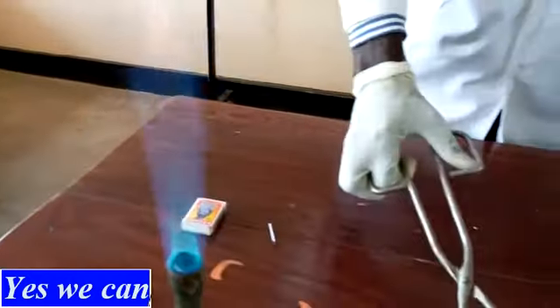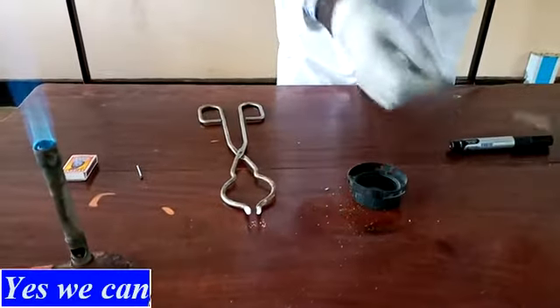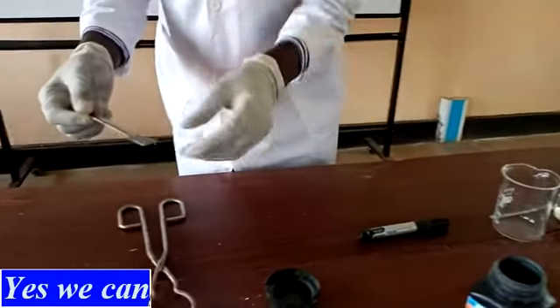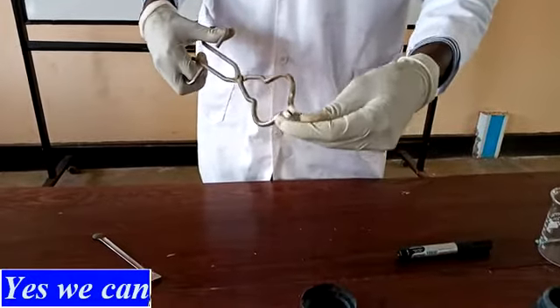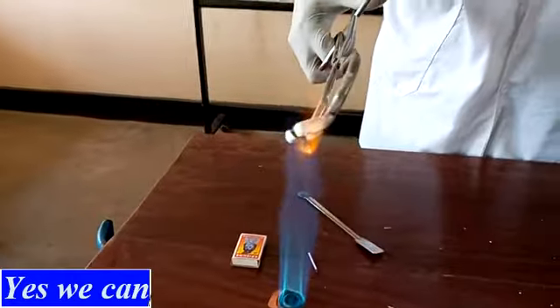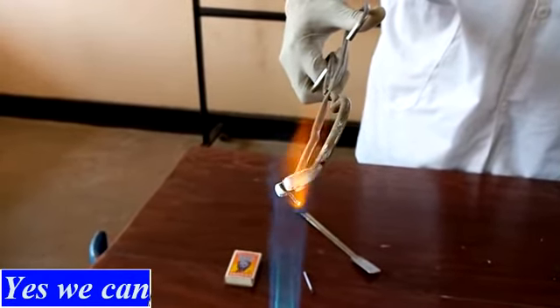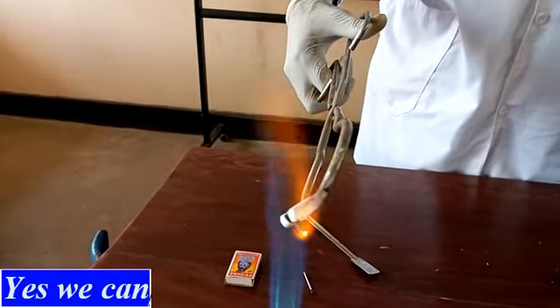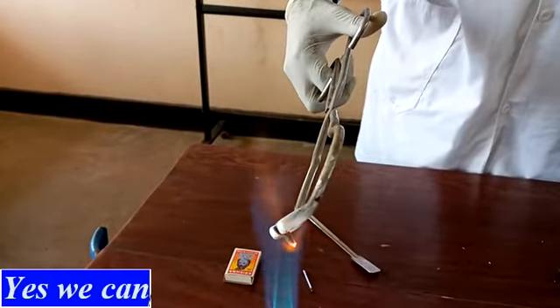Okay, now let's pick a bigger piece so that we can see it more clearly. So be very observant. What's that color of the flame? I hope you have seen the color of the flame.